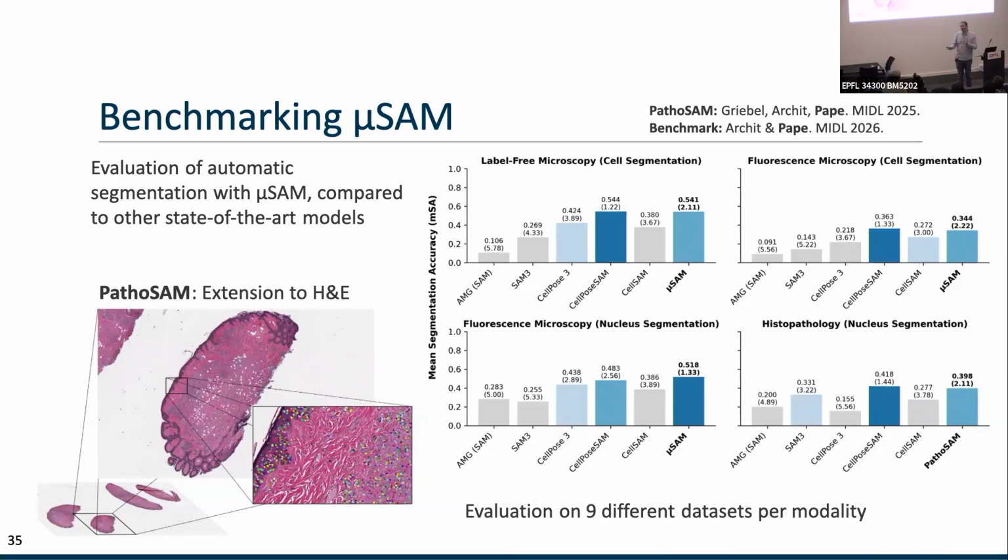If you try to implement this, there are a couple of specific issues. For example, the annotations are never really fully correct from the human annotators, because there are also ambiguities and so on. So penalizing these too harshly will lead to very bad values. And what is established in the field now is to do this for different thresholds. So basically saying if they match to 50%, we count this as accurate enough. Then also going to 55 and so on, and then averaging over all of these.